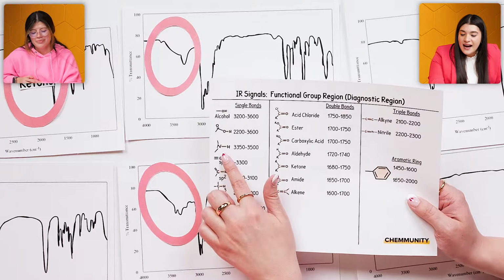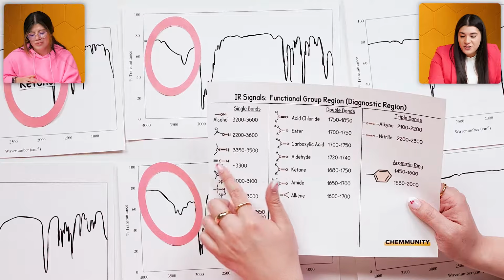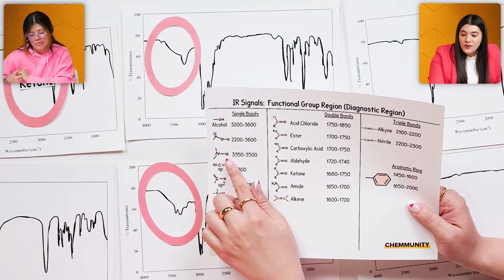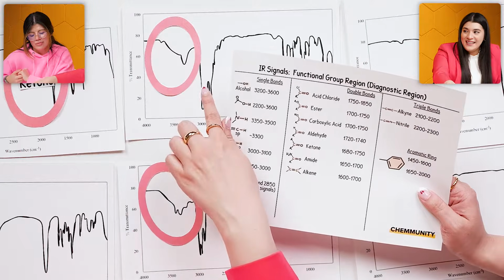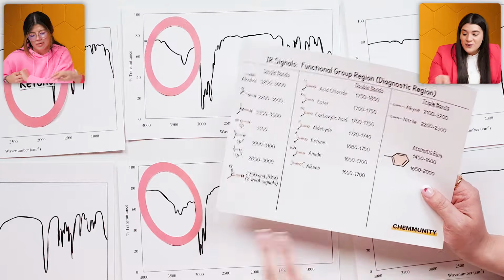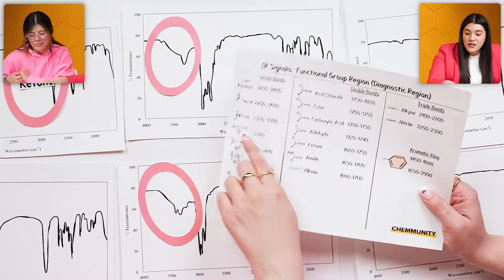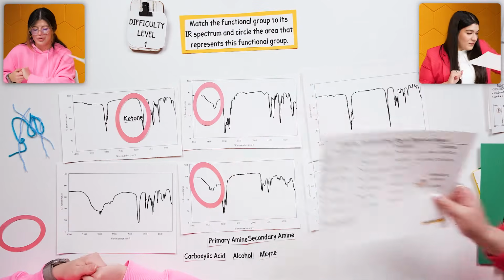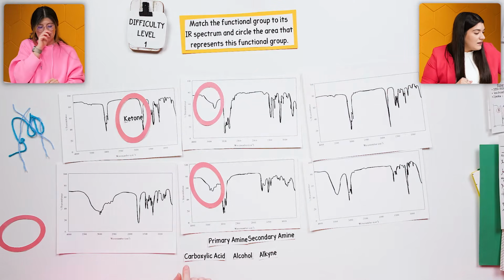Now notice this is highlighted. Just the N connected to the H, the nitrogen connected to the hydrogen, tells me that's within this range. There's only 1 hydrogen there, so there's only going to be 1 peak. When there are 2 hydrogens, which is a primary amine, there's going to be 2 peaks. So for every nitrogen bonded to a hydrogen, we see a peak within that area. So this one would be the primary then, because it's bonded to the 2 here.